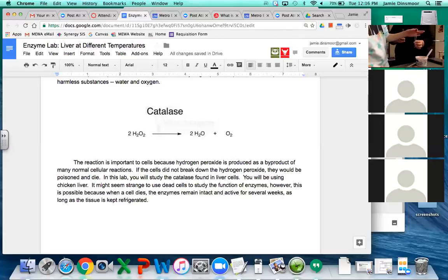But I gotta go get my backpack. All right, these two are done. It slides down the tube really fast, guys. Like really fast. It's lit. Well, it's slippery. Dude, I can't put it... Oh, it's stuck to my finger. What did I do with my backpack? It seems strange. I don't know. Oh, actually, I know where it is. It's in the workroom. Come on, liver.